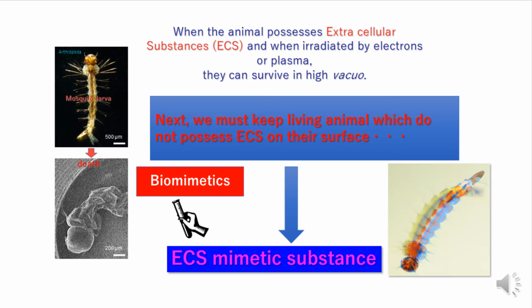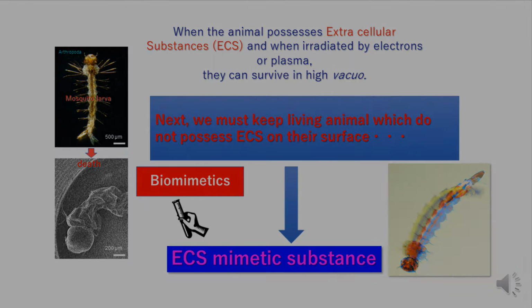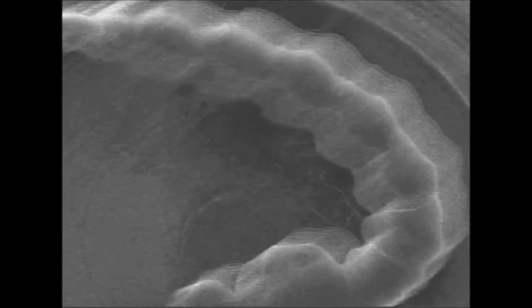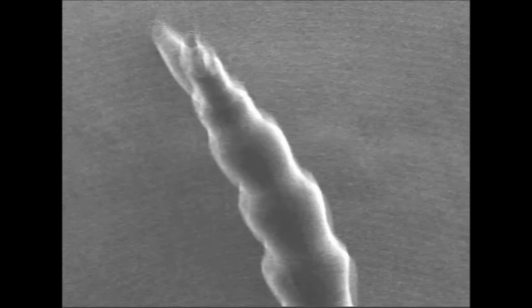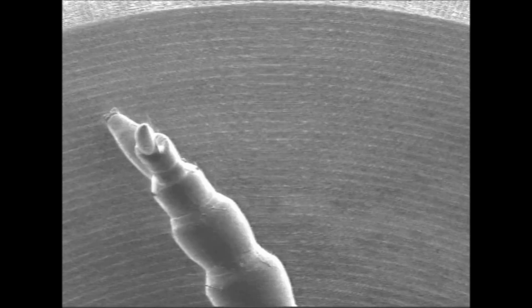I tried applying it to coat a mosquito larva's body, which usually dries out in a vacuum as shown in the lower left figure. Then I put the artificial ECS on. As a result, it moved as usual, like in this slide, in an electron microscope. They can survive and move in harsh conditions with electron beam bombardment, and some of them have emerged as adults. We coined this functional membrane the nanosuit.